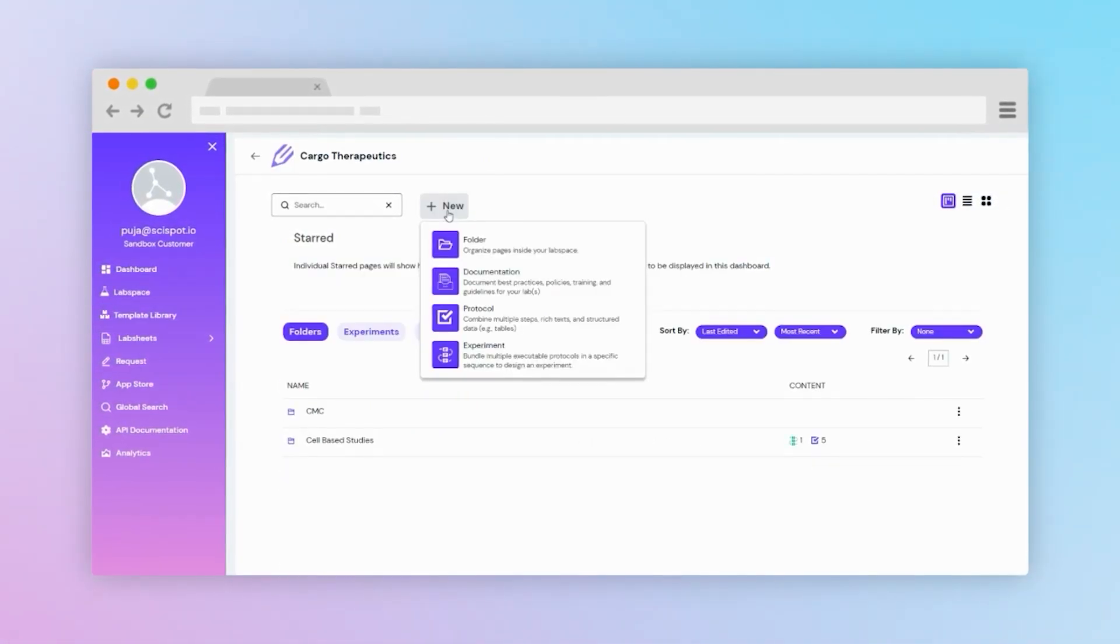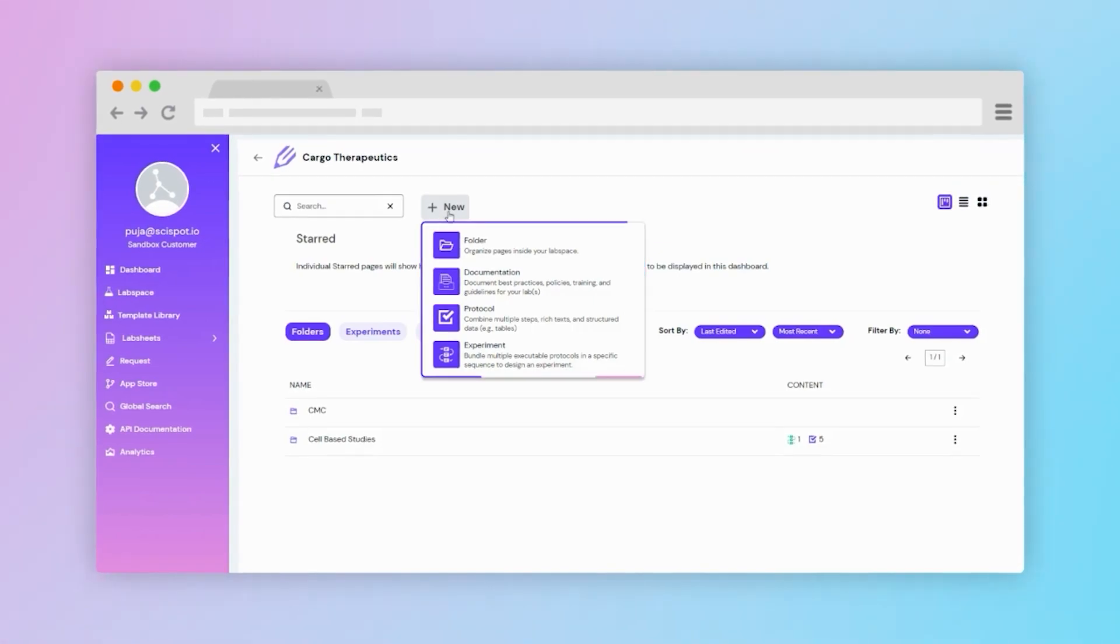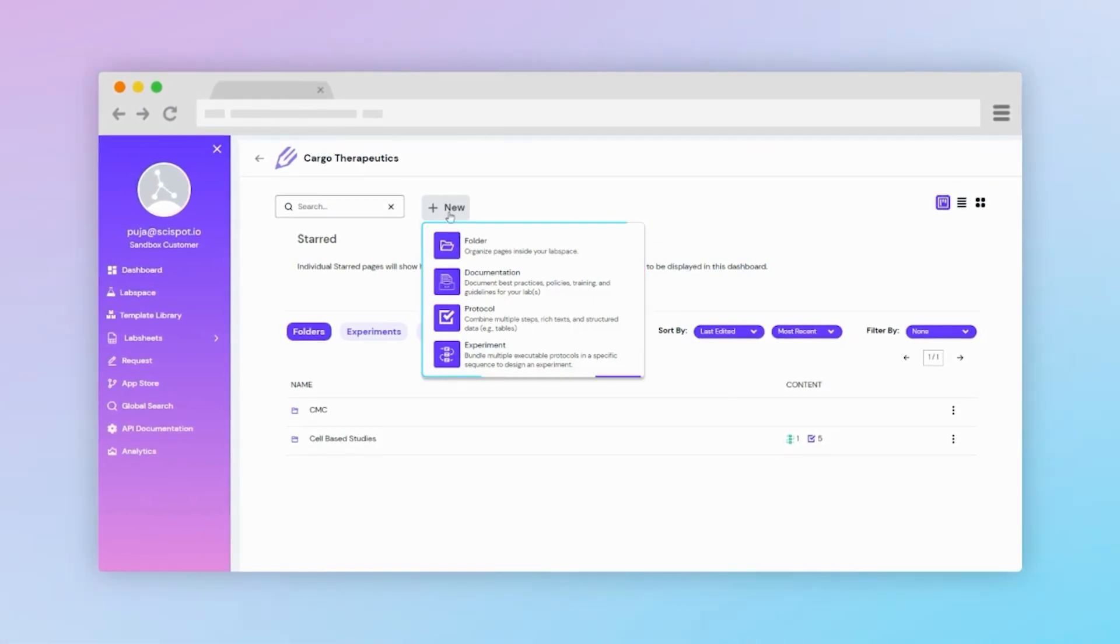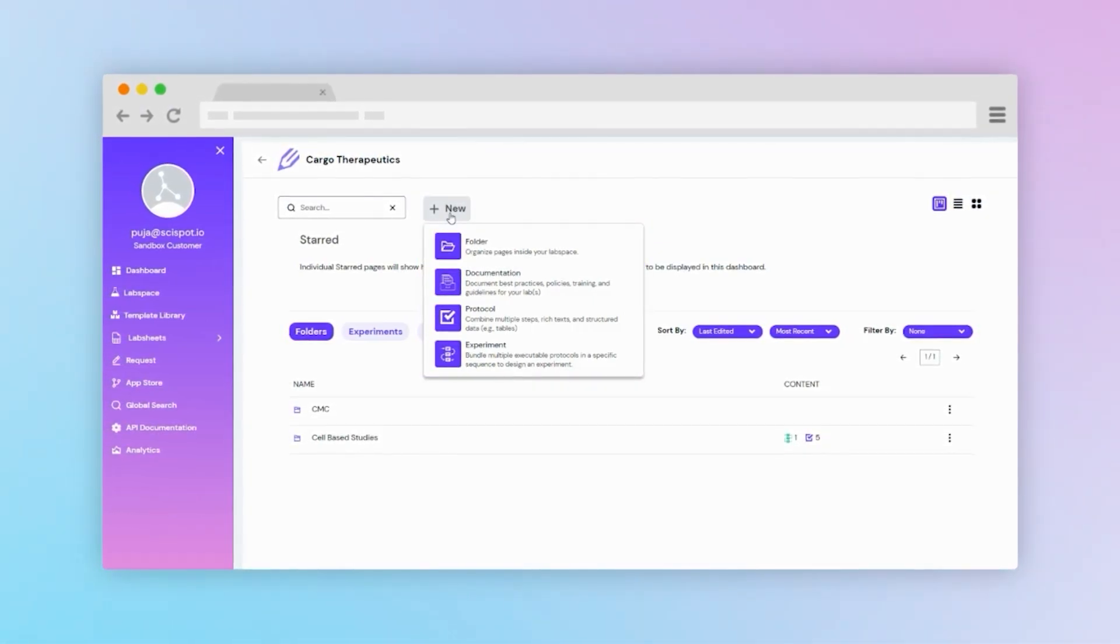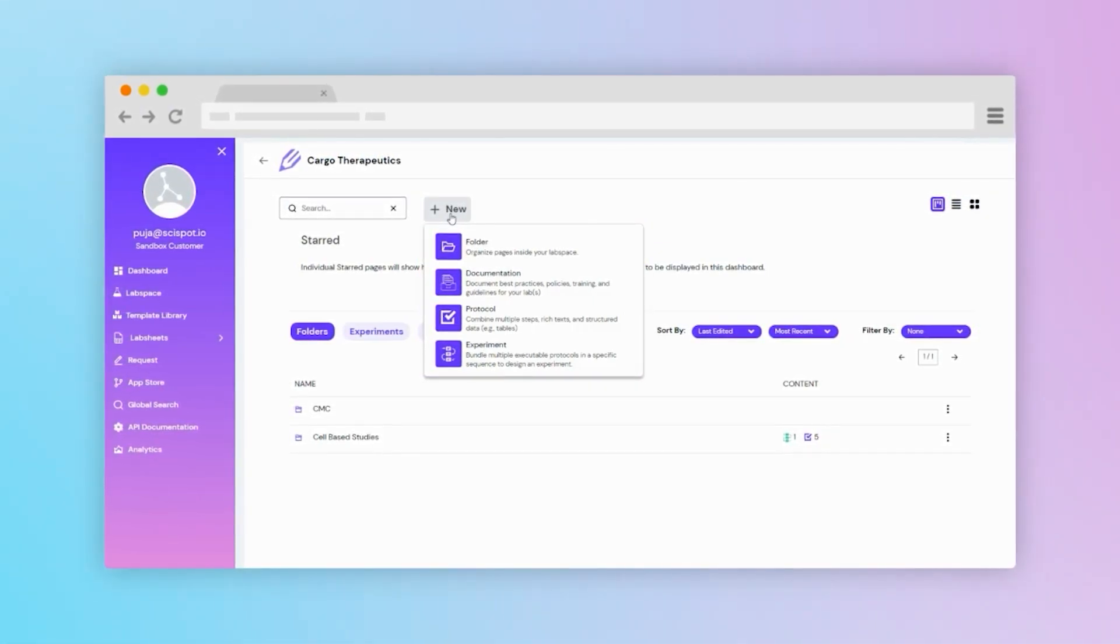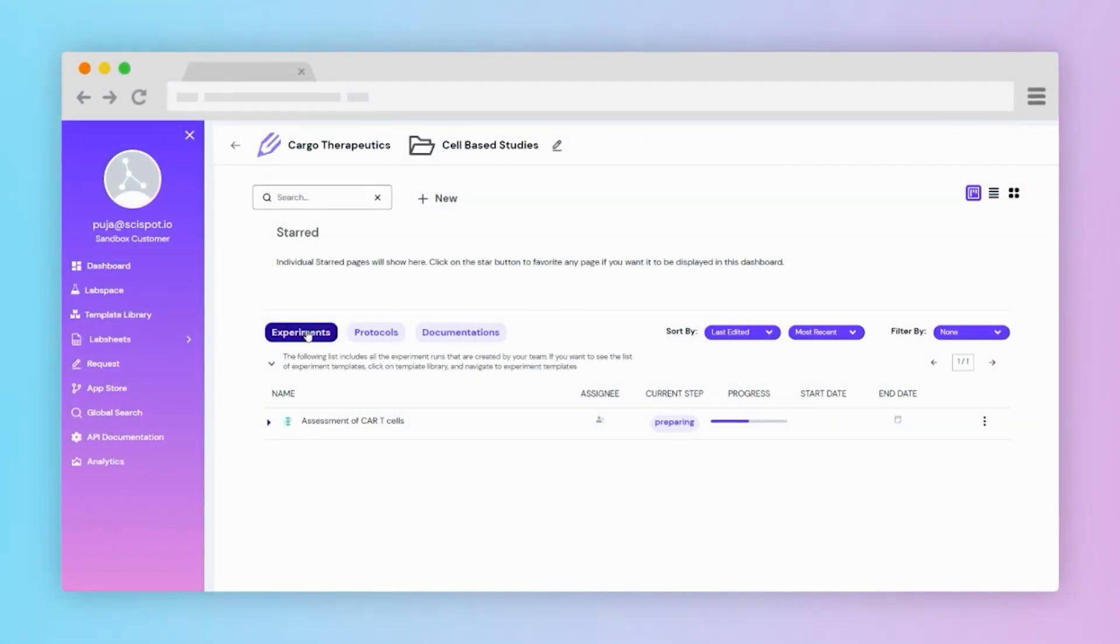Inside LabSpaces you can create folders, protocols, experiments, and documents to streamline your daily routine. Let's check one experiment.